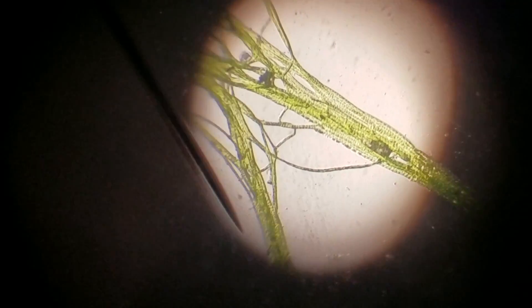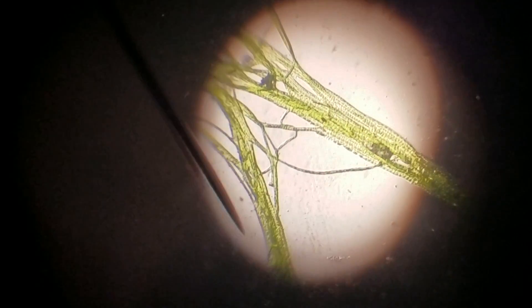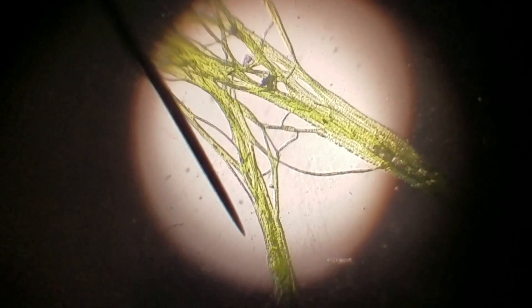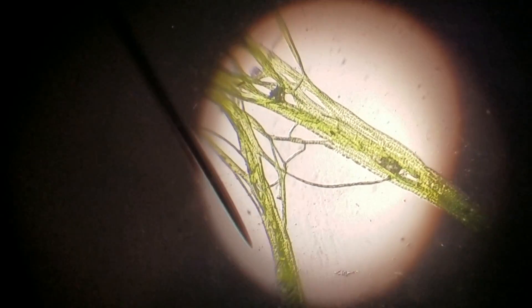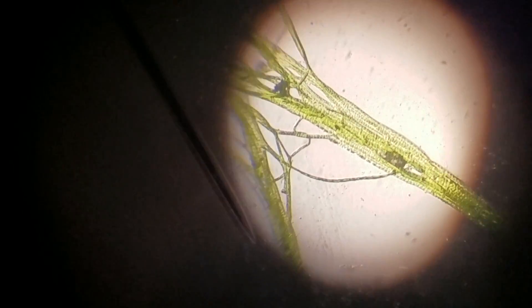What cyanobacteria is is bacteria that traps sunlight and uses it as energy. That means it just needs water and sunlight to exist in its most basic forms, and it can be floating in the air as a single tiny cell, or it can be in these colonies.